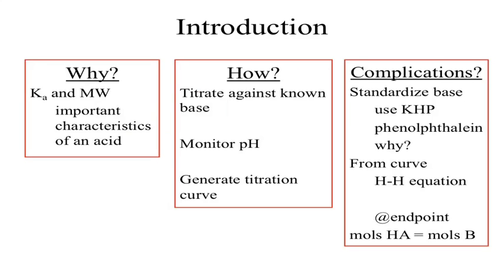So why do we end up doing this one? We want to find the Ka and the molecular weight. So a good thing to show up in your introduction would be, and in the discussion conclusion, the Ka and the molecular weight, your actual results.